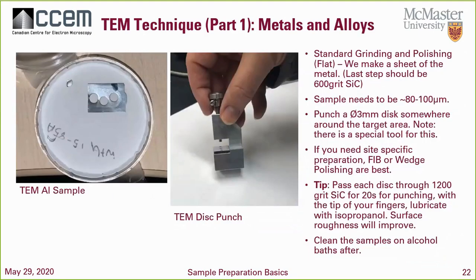Now, I want to talk about a TEM prep, right? So as you can see here, let's say we want to do some metals and alloys. We're going to mount in our lapping tool, and we're going to start our standard grinding and polishing steps because we need flat surfaces, right? I recommend doing both sides.